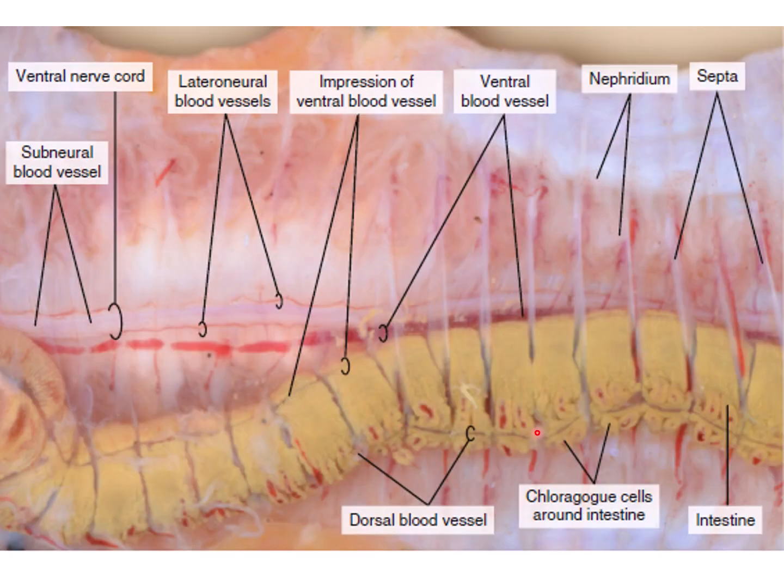The dorsal vessel is a dark brownish red blood vessel that is running on the dorsal side of the intestine. It could be easily observed, and there are smaller blood vessels exiting from the dorsal blood vessel. But we cannot see the ventral blood vessel from the dorsal side, because the intestine and digestive system are covering it.